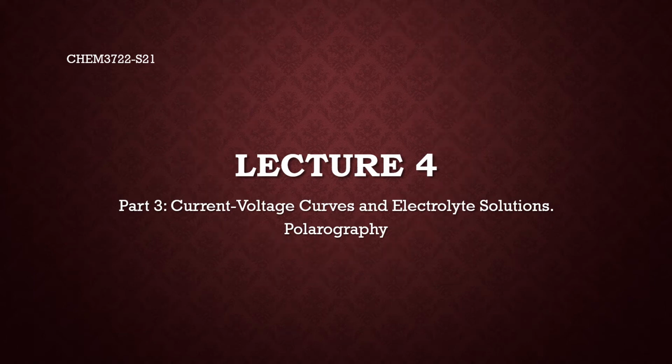This is lecture 4, part 3. I'm going to turn current voltage curves into a practical application in chemistry, namely electroanalytical chemistry, in which you sweep the voltage applied to a cell containing an electroactive agent and then monitor the current as a response.